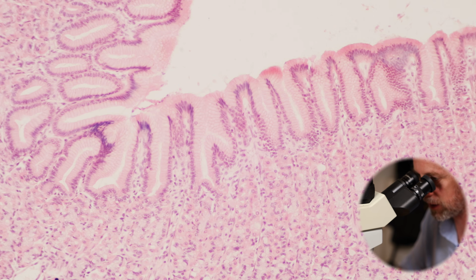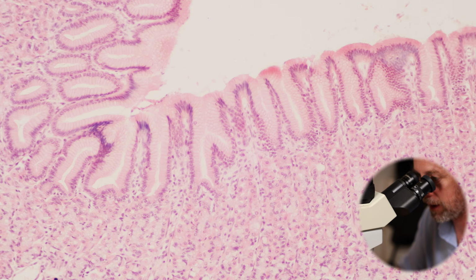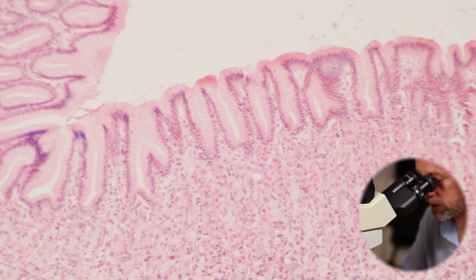Such a pretty section. Now those folds, don't mix them up with what we'll talk about when we'll talk about the small intestine. The job of the small intestine is about absorption. It's about maximizing surface area. Here, this is a structure that's producing mucus and producing hydrochloric acid and producing pepsinogen to break down proteins.